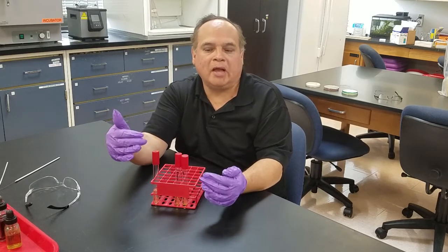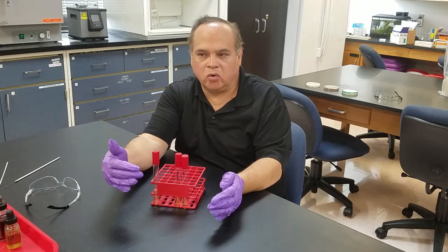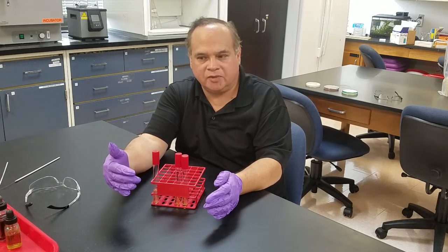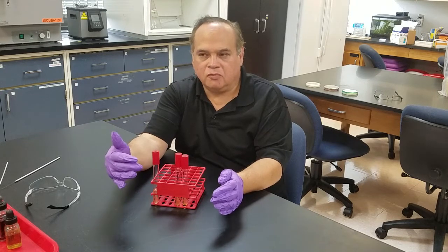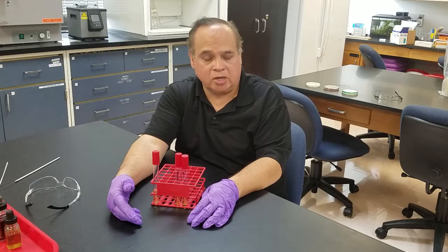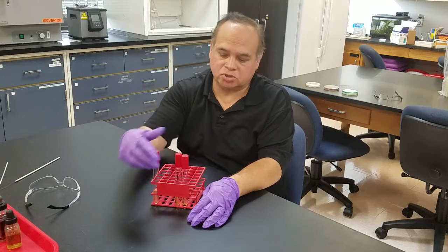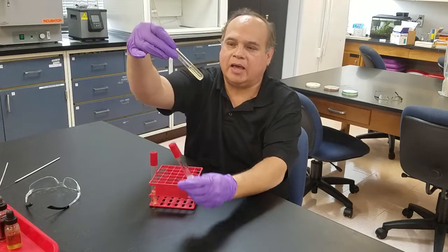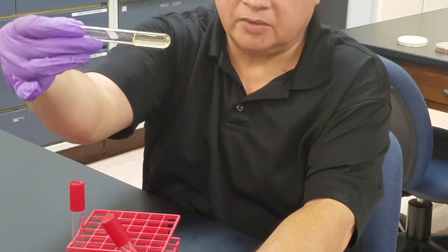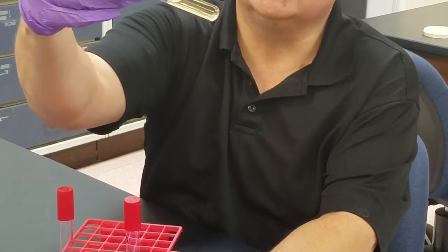We'll come back, put them into the refrigerator, and those particular organisms that were able to break down the gelatin — the medium would remain liquid. Those organisms that could not break down gelatin, the gelatin would re-polymerize and be solid. Here's the difference between the two tests: you can see I can move this one — that's negative — and here I can move it just a little bit and you can see there's liquid, so that's positive.